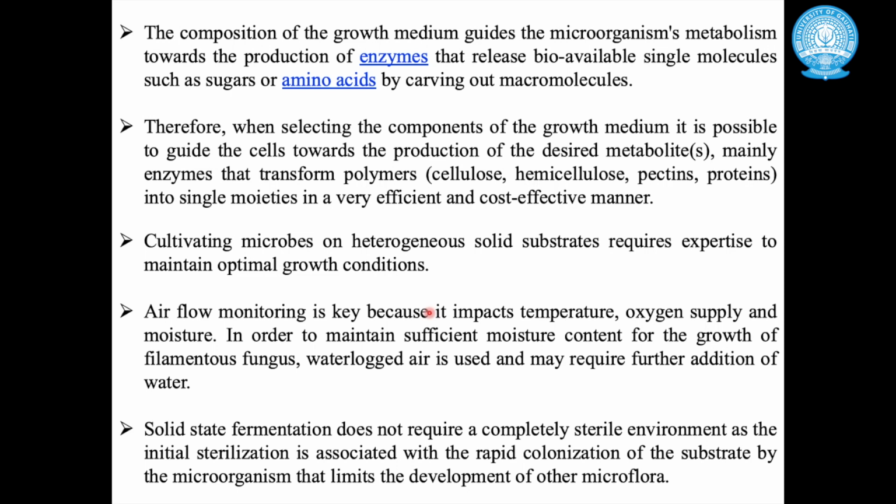Airflow here is monitored, and it is key because it impacts temperature, oxygen supply and moisture. These things are key to any kind of fermentation process: temperature, number one; number two is oxygen supply; and moisture, of course, is the most important part in finding out whether or not these fungi are growing.